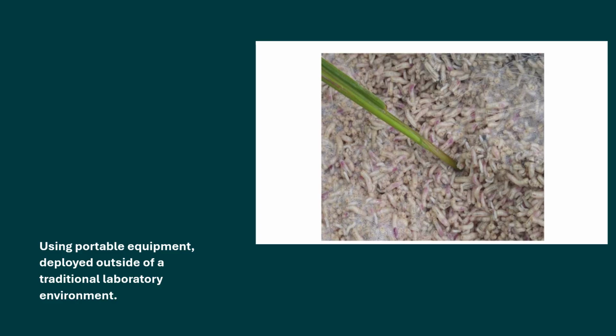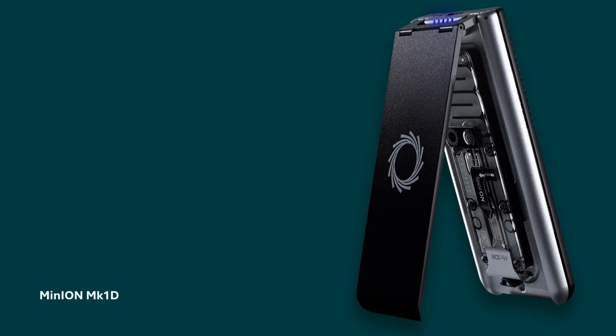DNA extraction and sequencing in this project will be performed using a commercially available kit designed specifically for nanopore workflows. The goal is to develop practical protocols for recovering and sequencing DNA, both from skeletal remains and from insects associated with decomposition, such as those found on human remains in forensic contexts.